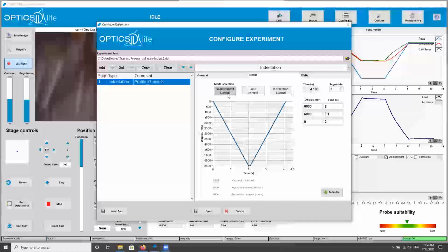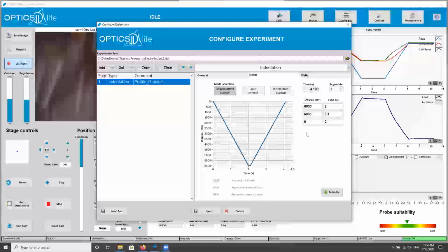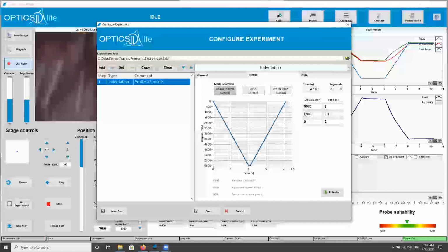In this experiment, the instrument is only controlling the Z piezo, which is what moves the entire tip up and down. For example, I had told the tip to pull off the surface 5 microns after it found the surface. So I might write a program that looks something like this, where it's going to start at a starting point of 0 in my Z displacement.